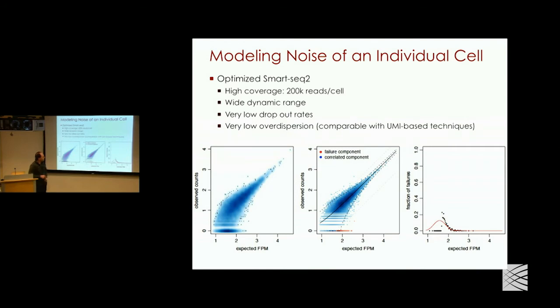Yeah, this is actually a good point, and it's something we haven't emphasized, but it's something you have to do. Even in these newer methods in processing, you can typically get crude populations pretty well, but if you want to refine it, you're better off refitting the cell sizes based on the initial subpopulations to get more accurate estimates. And what you're showing in these plots is the average, so the observed counts.